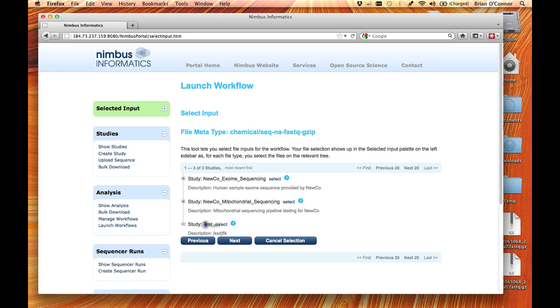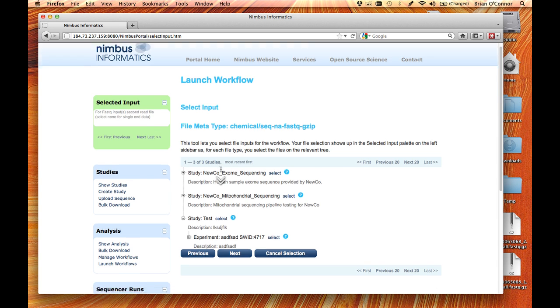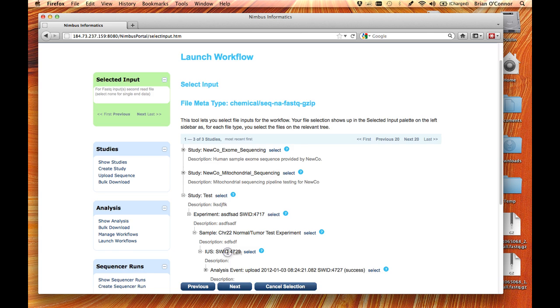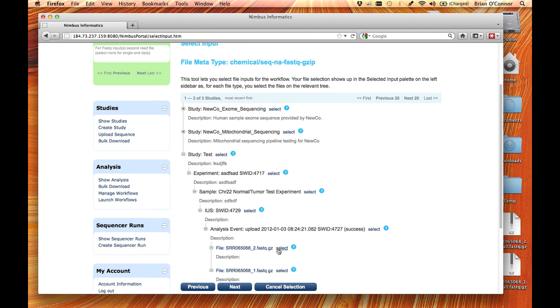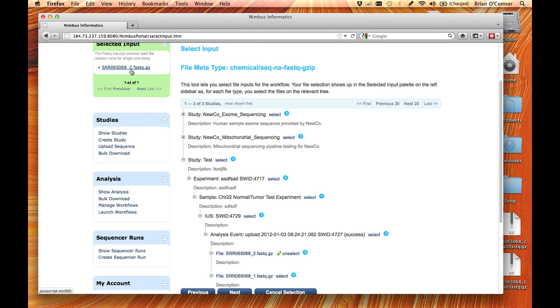And I'm going to do the same process, but this time, if I click on here, it's going to tell me that this is actually for the second read. So I'm going to drill into my study experiment sample, look at the upload, and then I'm going to select the second read. Now again, you could have multiple second read and multiple first read files. The key is that they need to be in the same order. So the order of the first reads dictates the order of the second read files. Generally speaking though, unless you're doing whole genome work, most people for exomes are going to have just a single lane worth of data. So you're going to have an individual first read and an individual second read file.